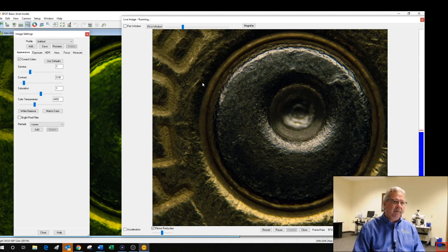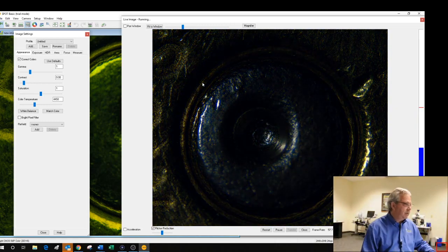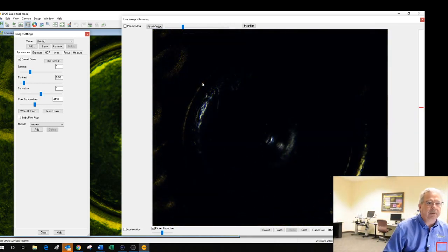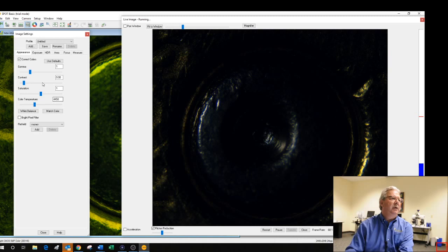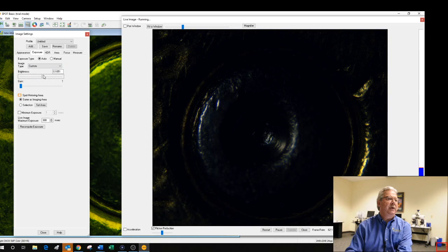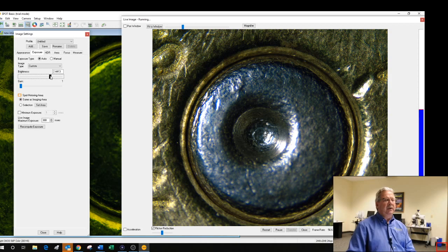So as you can see there, I've got good color for my fluorescent, and I'm going to step away for a second here again, and I'm now going to go to the other side where I have a sample that you can't see. So I'm going to make that a little brighter if you give me a minute here. Went into exposure here, and I went into brightness. You maybe can't tell perfectly, but this light is rather blue. You can see that the center primer here, instead of being silver, looks blue.